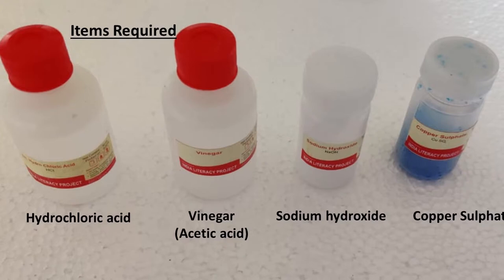We are testing the pH of hydrochloric acid, vinegar which is diluted acetic acid, sodium hydroxide, and copper sulphate. You can choose any other available solutions to test the pH. As sodium hydroxide and copper sulphate are available as solids, we have prepared aqueous solutions for the same by dissolving them in water.